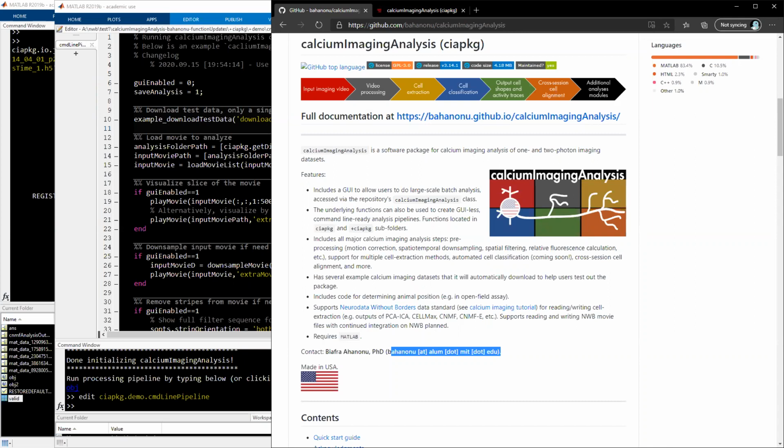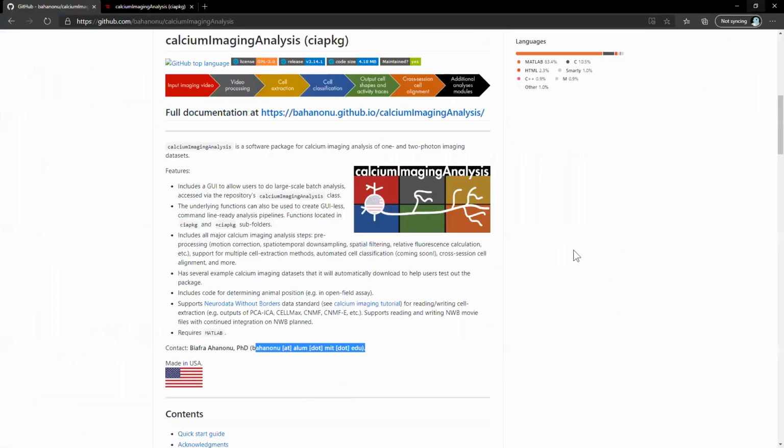Sweet. Well, thanks, Biafra. That was awesome. Like so many different things. It seems like every time I think I have a full picture, there's another little GUI to adjust the contrast, and I'm like, oh my God, he's got that too. Yeah, I feel like that's one of those things where you have a UI specialist, and then when you're an experimentalist, you're just like, I want it to run in batch and do this. Yeah, so sometimes someone gives me feedback, and then I'll add that in or change that.